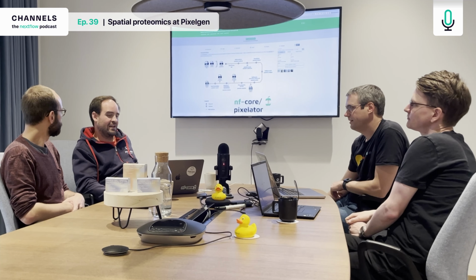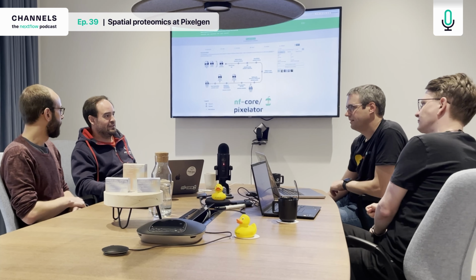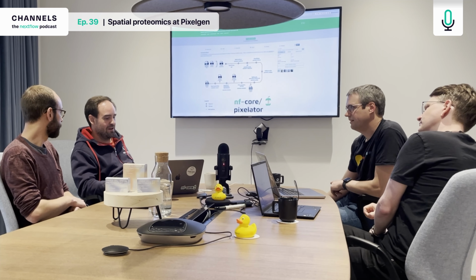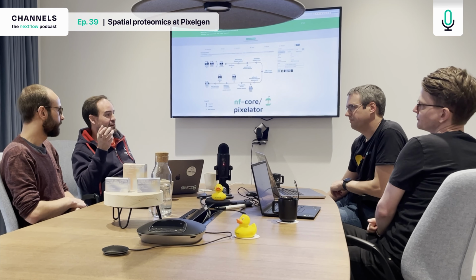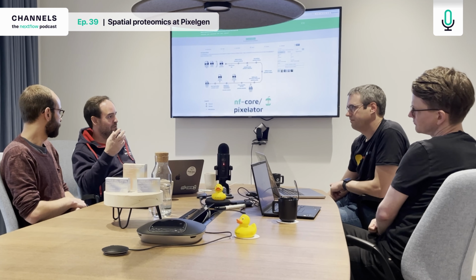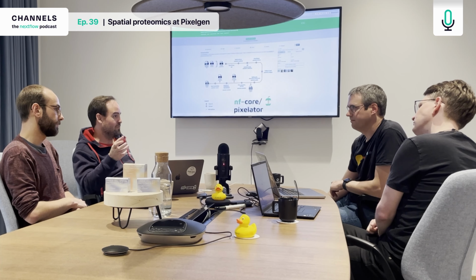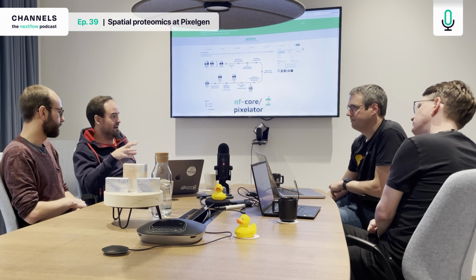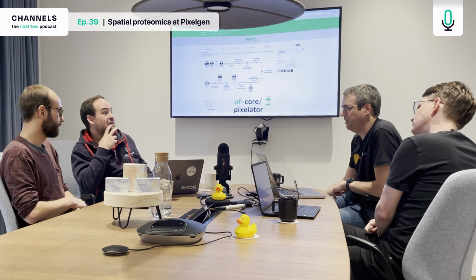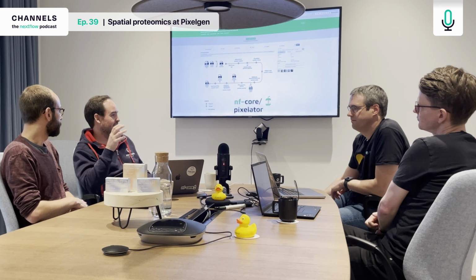Yeah, as Florian said, with simplicity in mind, we see it on different levels. One of them is the intelligence of Pixelator, which is also open source. If you are thinking of a new algorithm or a new way of processing the data, maybe that's something you want to put in Pixelator and encapsulate into one of these command tools. There's a plugin infrastructure there, and then you can put a stage on top of that.